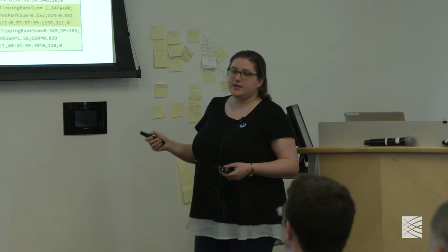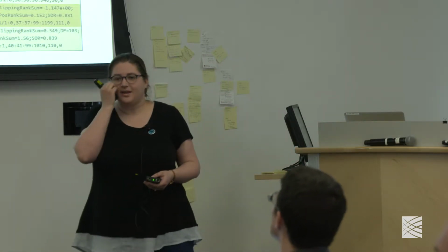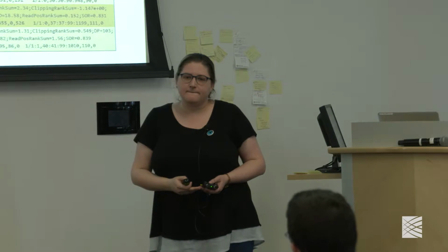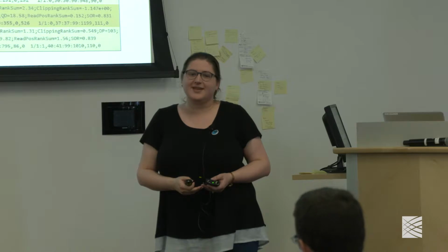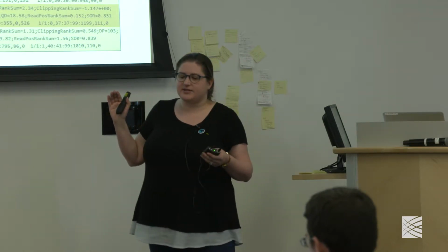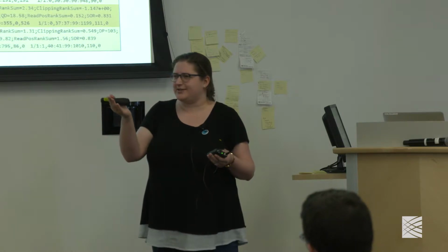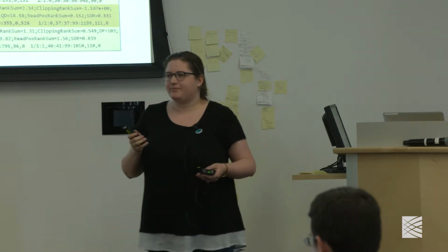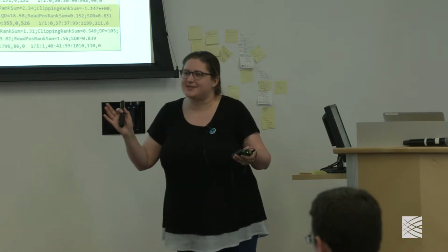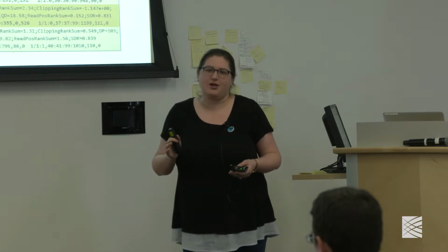So the first step of the pipeline, yes? Just a quick question. Is there some empirical measure on how many samples you would require to jointly call in order to start getting benefits? Clearly, the more the better, but does it matter if I have 100 samples or 1,000 samples? In the germline context, I think it's in the hundreds, is that right? I'm looking at Geraldine, sorry. We'll talk about that in more detail tomorrow. But even 100 samples is still well worth it to do a joint call set.